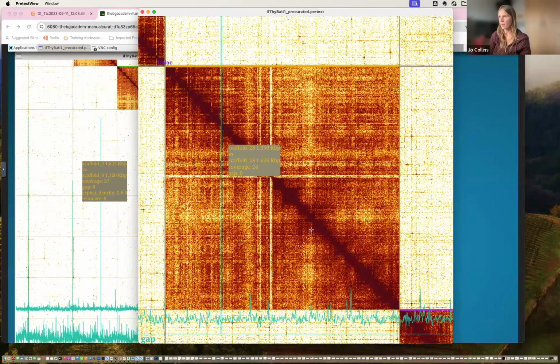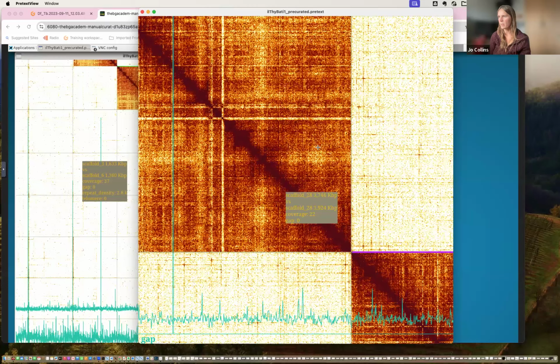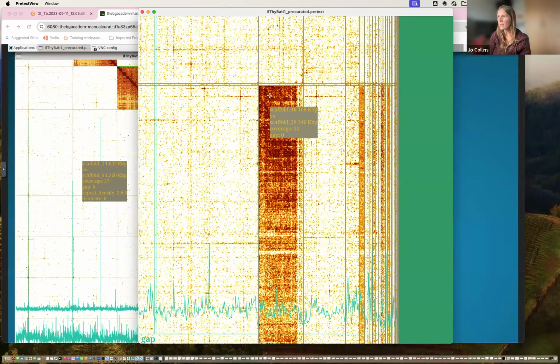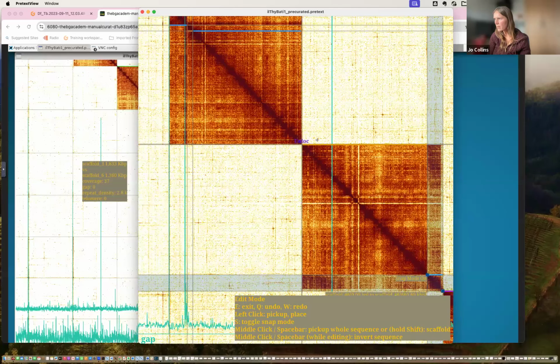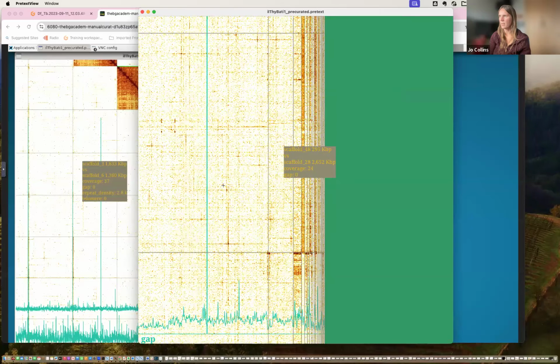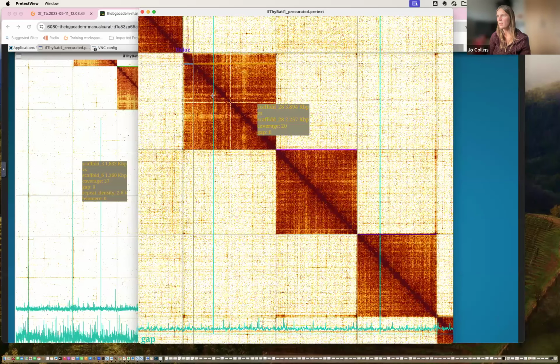And then we go through here. It looks okay. Signal's a bit low there, but not low enough to be overly concerned. You can't see it really clearly, but there is a strong match right at the top corner. So just going to flip that. And now we've got our good join. They're a bit not strong enough evidence really.